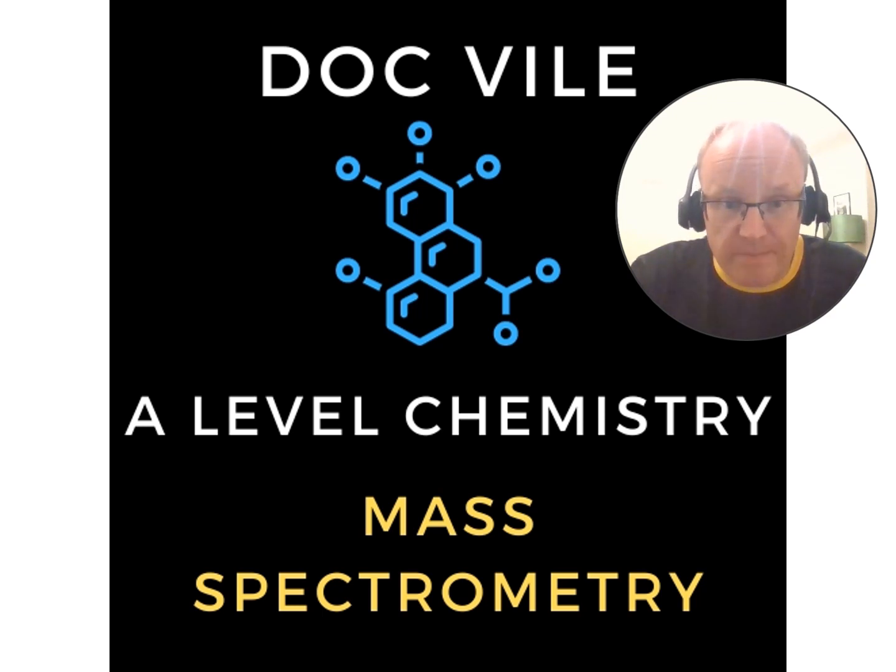This channel is all about getting you ready for your A-Level Chemistry exams, and this specific video is all about a technique called mass spectrometry, which is a molecular weighing scale for measuring the atomic mass of different atoms as well as the molecular mass of compounds. And we're going to spend some time explaining how it works and what useful information we can get from it.